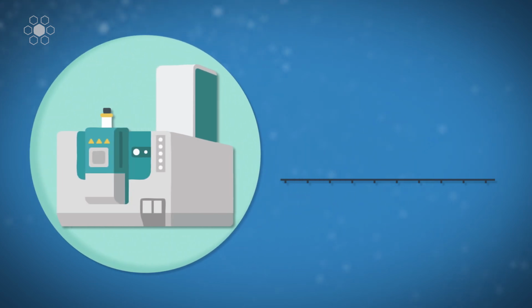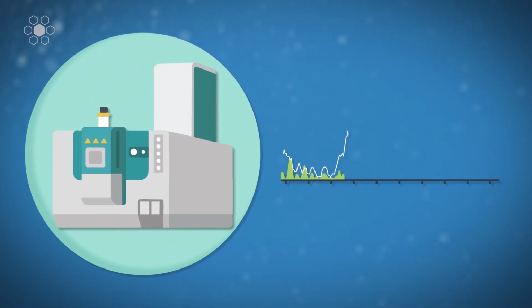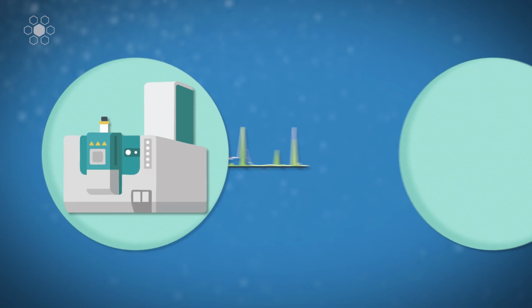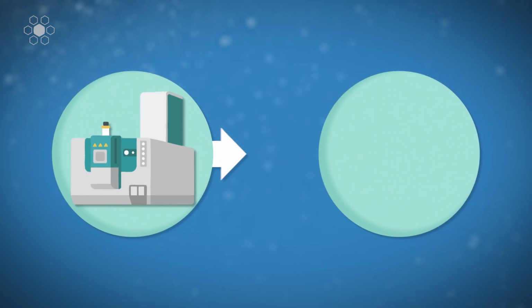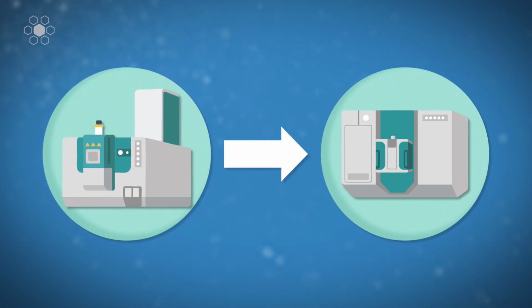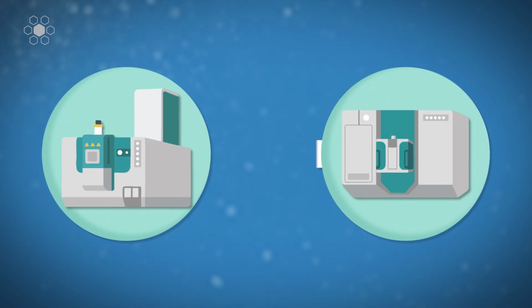The HRMS instrument allows researchers to determine the accurate mass of the analyte while generating complete product ion spectra that include fragment charge states from a single injection. The parameters established for these methods can be transferred to instrument methods operated on triple-quad mass spectrometers.